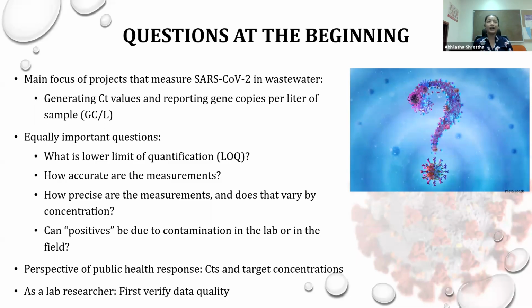So from the perspective of a public health researcher, we want to know the CT values and also report the target concentration in the wastewater. But as a lab researcher, we first want to verify that our data are correct and that we have a data quality standard. Otherwise, the reported CTs and concentrations would not mean anything.